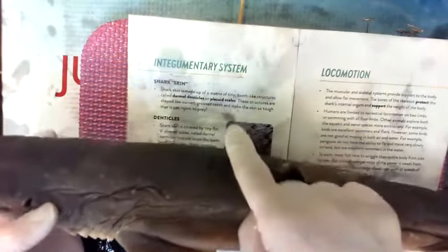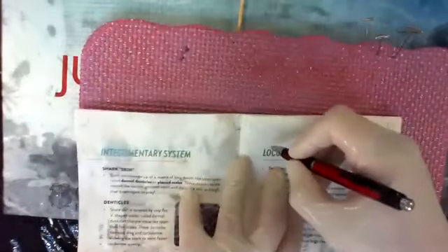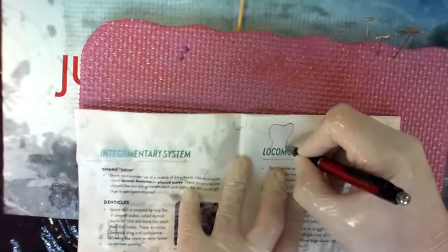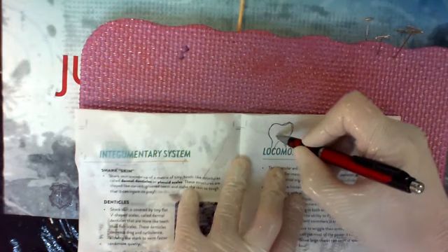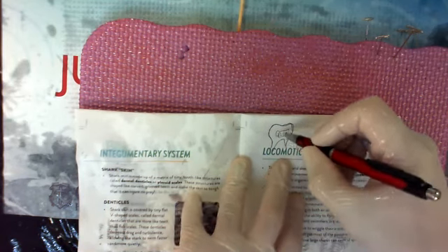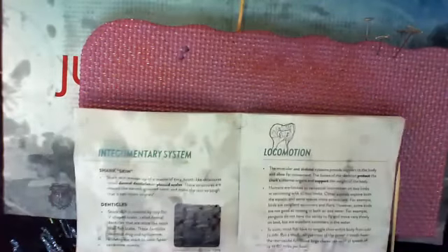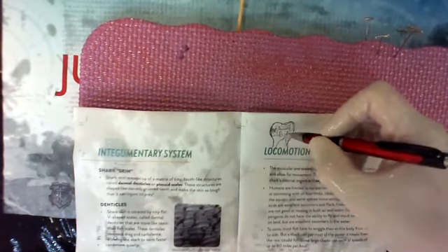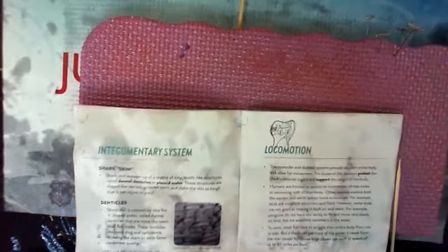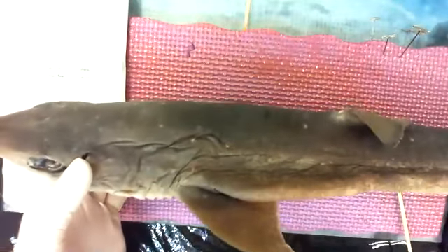These little tiny microscopic teeth that look like that are actually teeth-like. If you dissect a tooth, let's say here's your generic tooth fairy picture tooth, right? You've got the root, you have the enamel on the outside, you have a hollow core in here that we call the pulp, and then you have dentin, which is the strong material that gives it structure. If you take one of these and split it apart, it has an enamel outside, a dentin structure, and a pulp in the middle, just like a tooth. If you take a shark tooth apart, it has the same stuff. So a shark is kind of covered with teeth, millions of little tiny teeth everywhere to protect it.